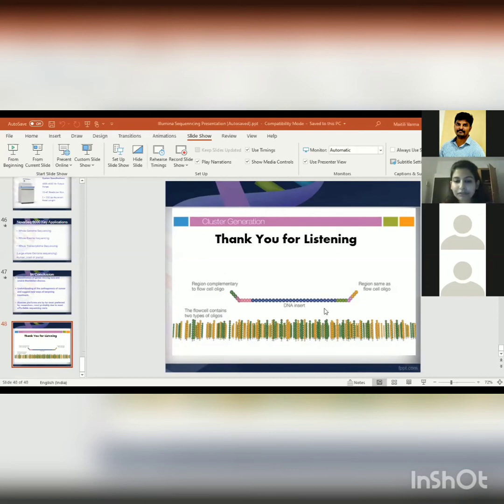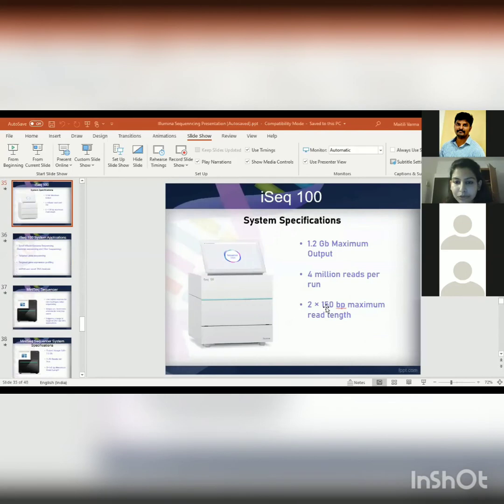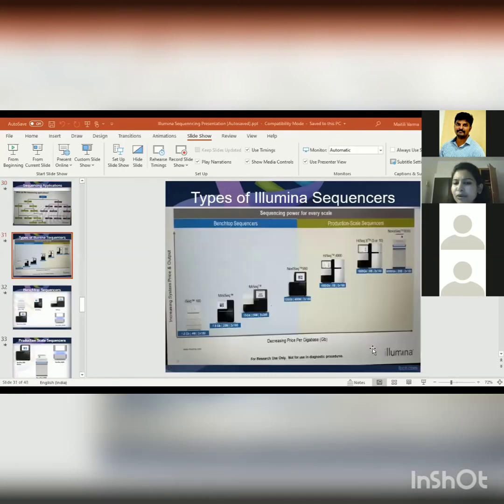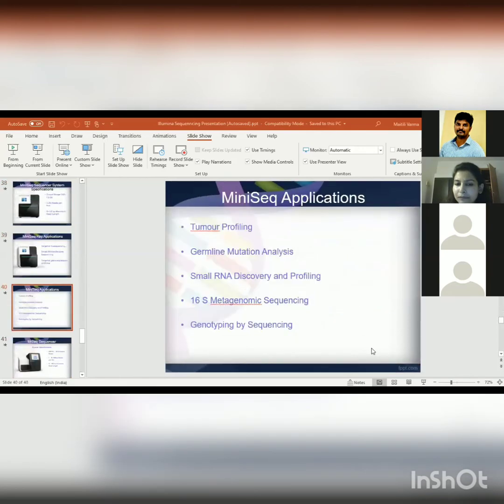Can you please enlighten us on meta-transcriptomics? Transcriptomics? You mean to say metagenomics? Metagenomics is mainly used for bacteria, to understand bacterial 16S RNA from different species. I was talking about that here. I don't think I spoke about anything else. I spoke about metagenomic sequencing.